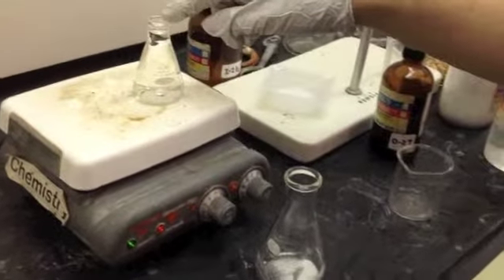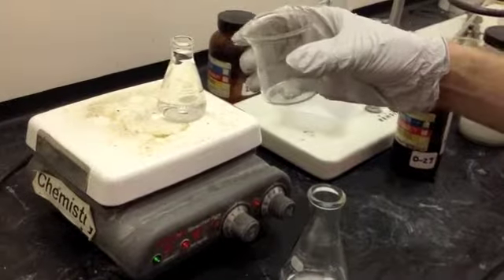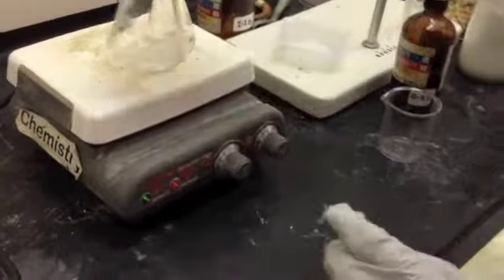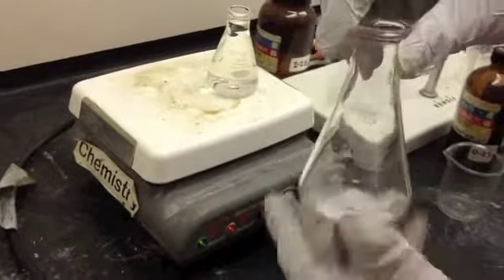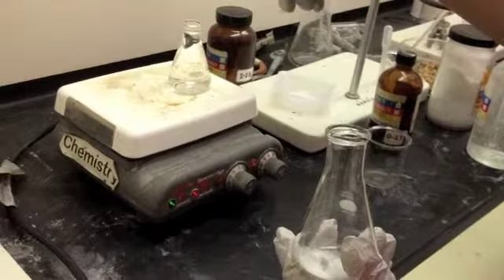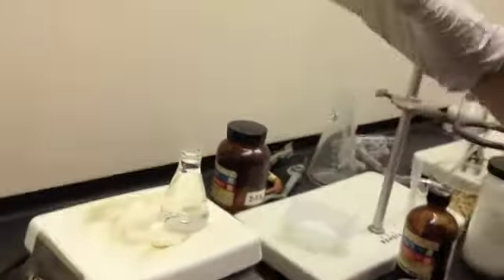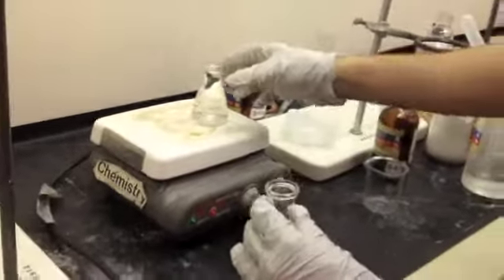You want to use an Erlenmeyer flask to heat up the ethanol instead of a beaker because the ethanol will evaporate too quickly out of the beaker, whereas not as quickly from the Erlenmeyer. So I'm going to add as little ethanol as possible to the benzoic acid to dissolve it. Now, one other note before I do that, you don't want to heat up the ethanol too quickly because then it will start boiling really fast and it'll flash. Flashing is whenever the solvent will just jump out of the Erlenmeyer flask. So I'm going to add as little as possible.